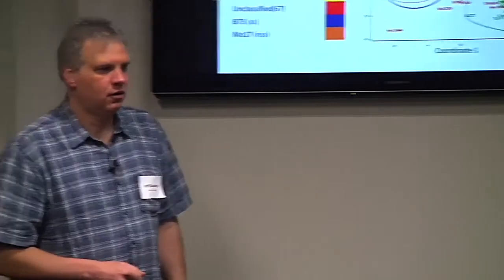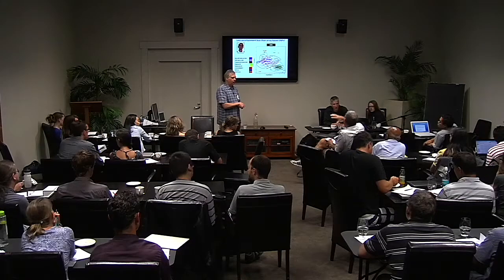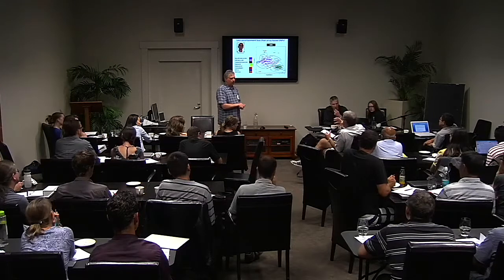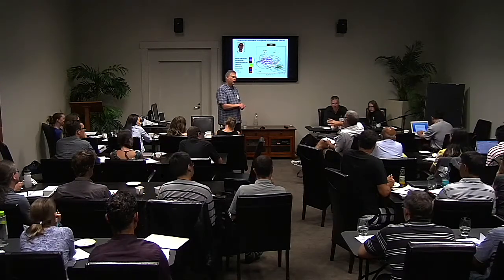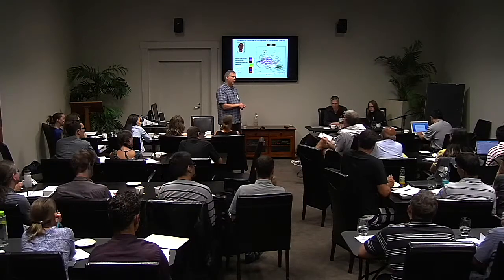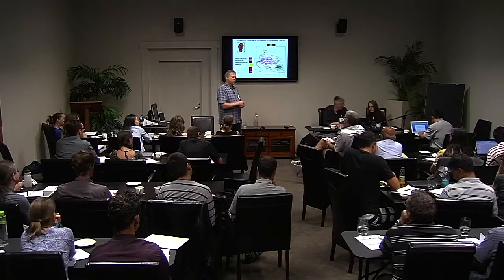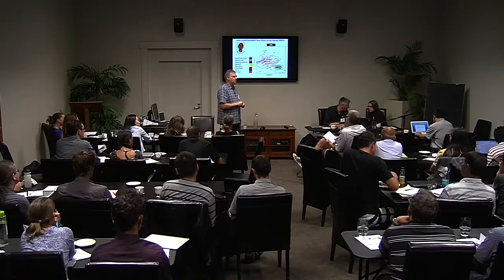Is there somewhat of a reciprocal effect, where if you were to discover these SNPs on the whole population? I work with mussels, and we run a breeding program, but we work with a bottleneck or a sub-part of that. What's the reverse effect if you find polymorphic SNPs in the world and then you're working with a constrained population? I think that's when you're most free of bias, and that's the approach we take to GBS.